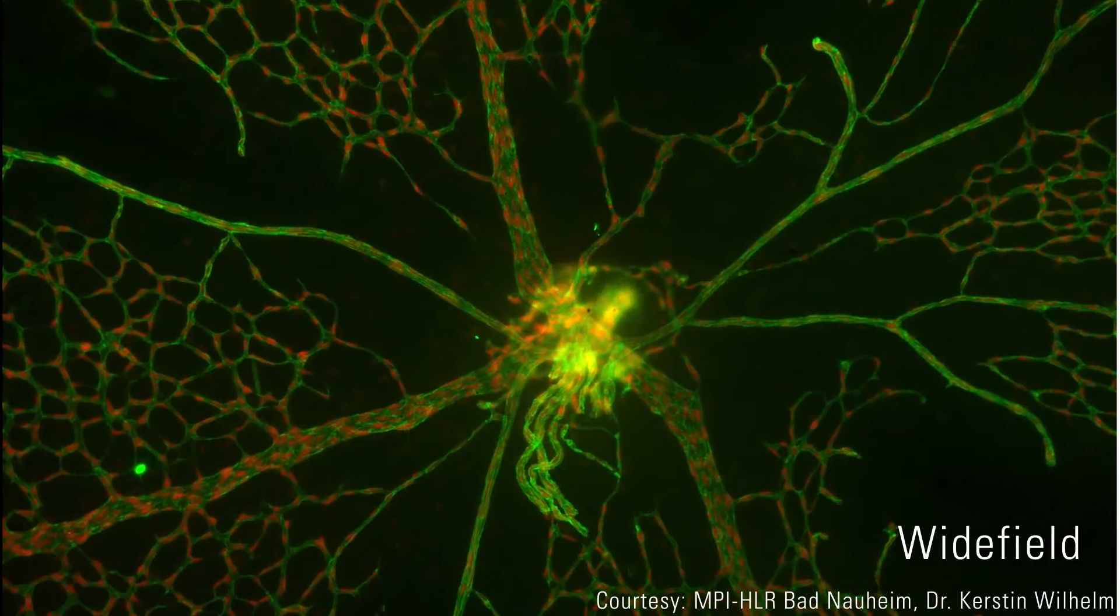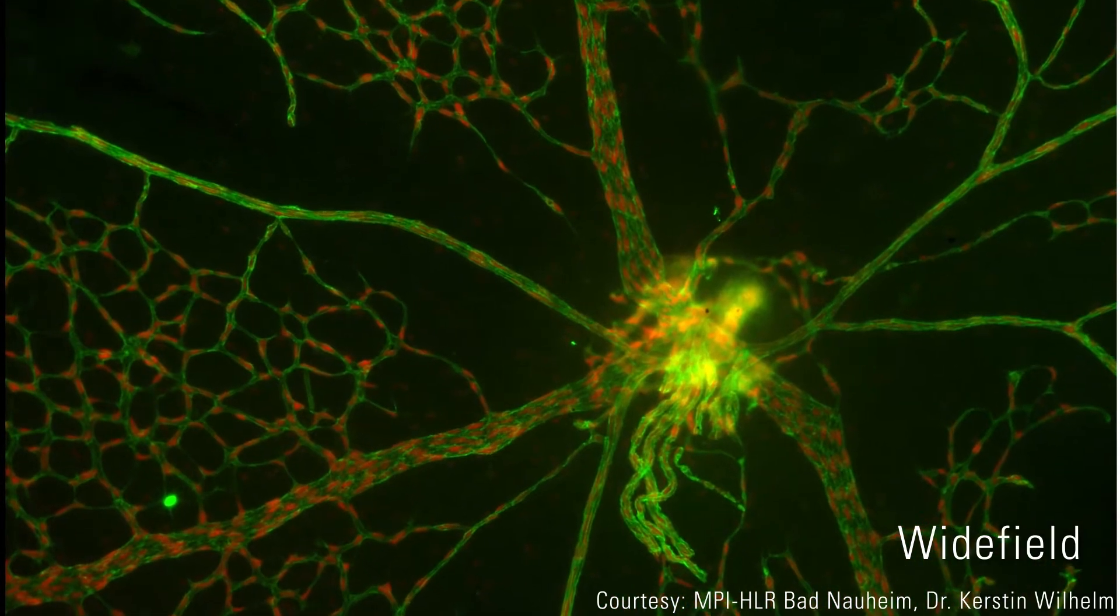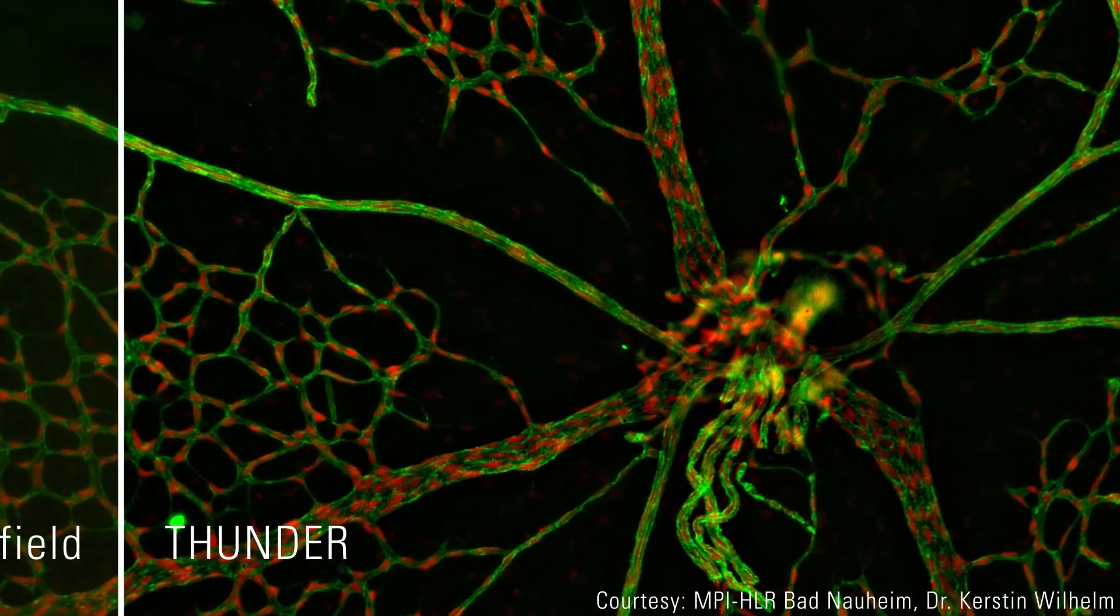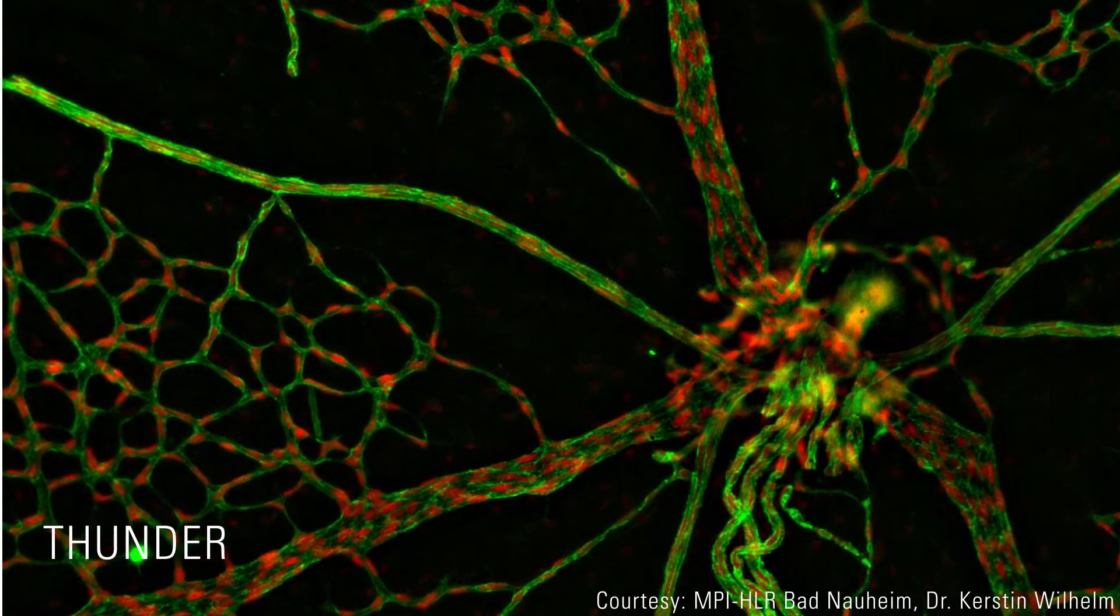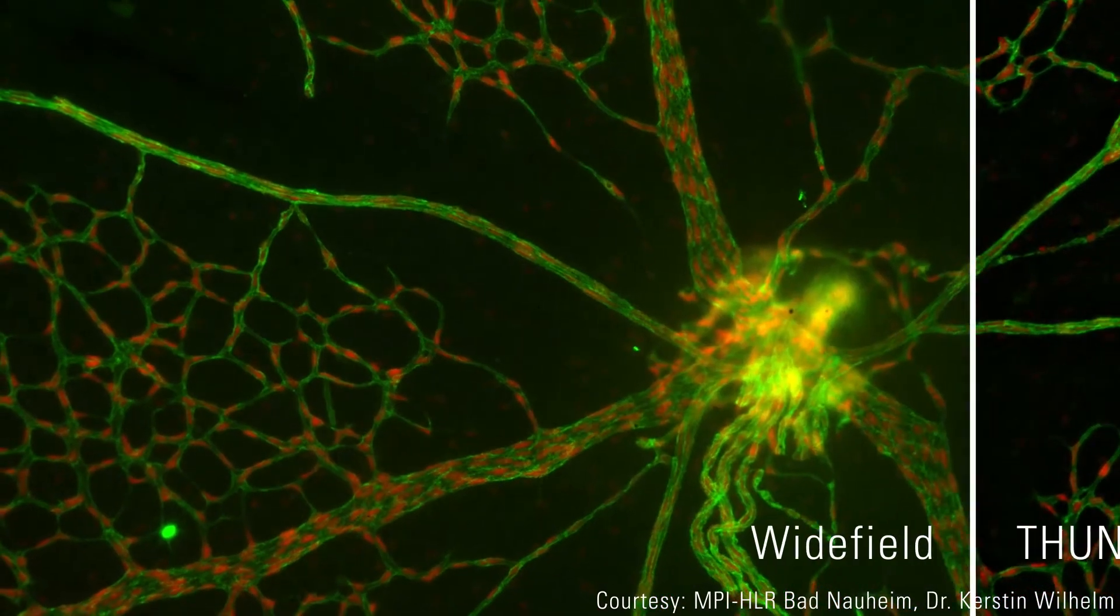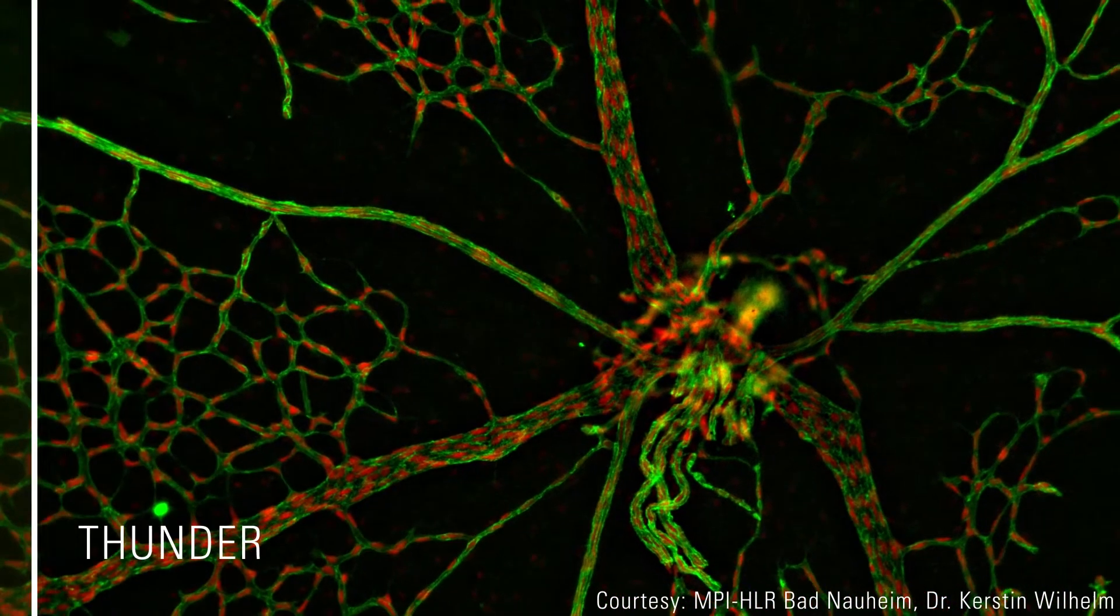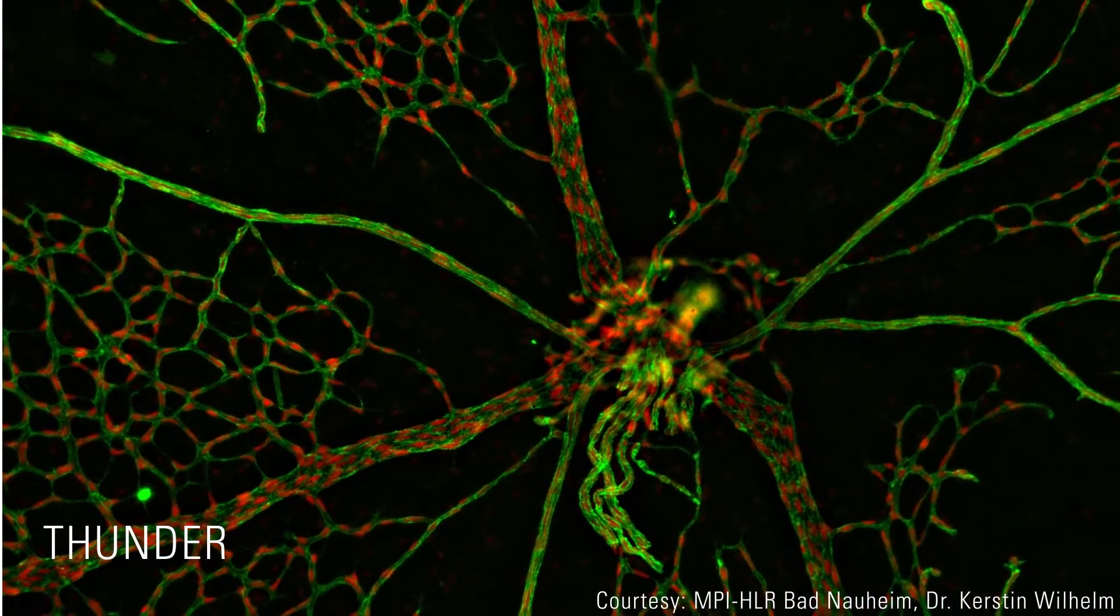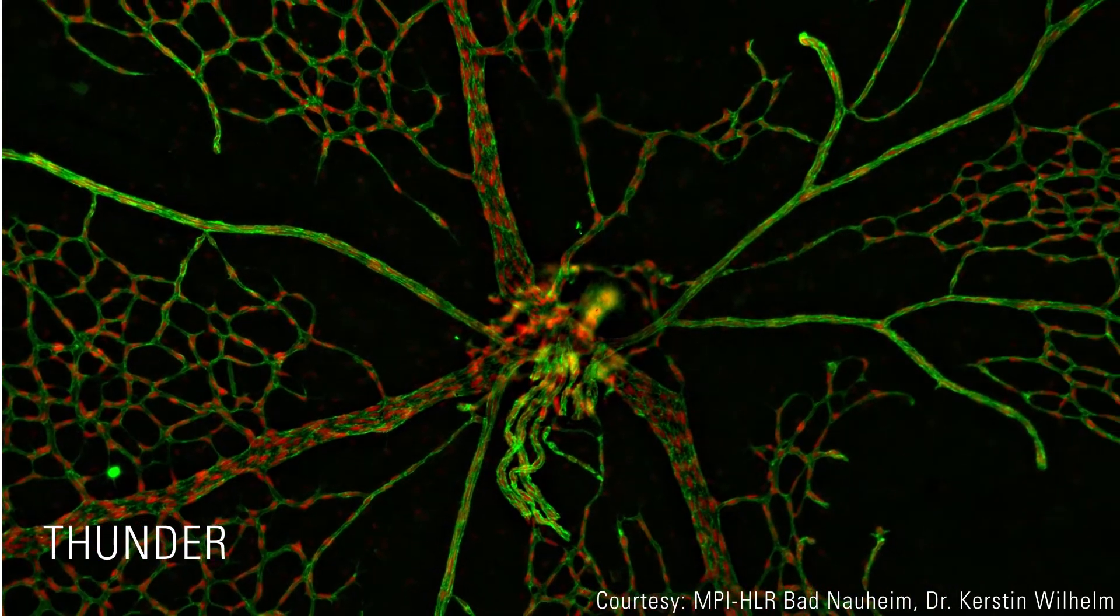Compared to images taken with a standard wide-field microscope, Thunder Imagers with computational clearing provide detailed images of thick tissues, free of haze from out-of-focus blur. This approach not only improves image quality but also allows challenging tissue sections to be analyzed with an easy workflow.